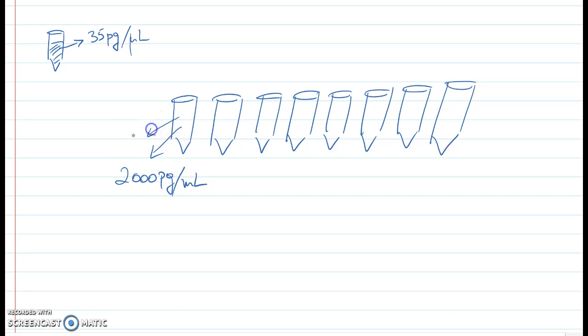So again, you're going to prepare 1000 microliters. Why don't you go over?